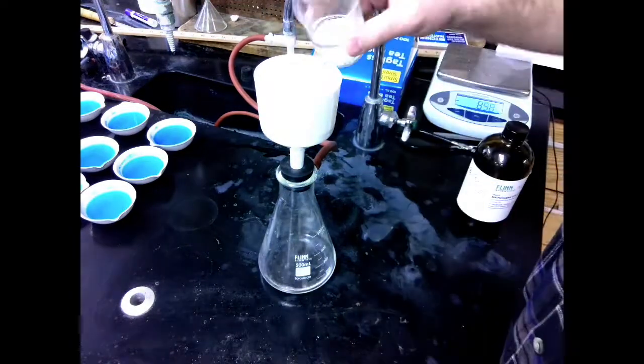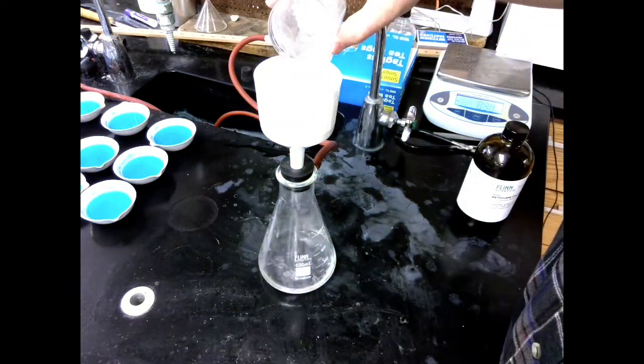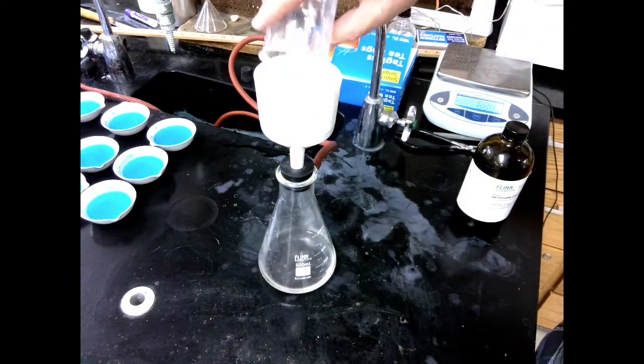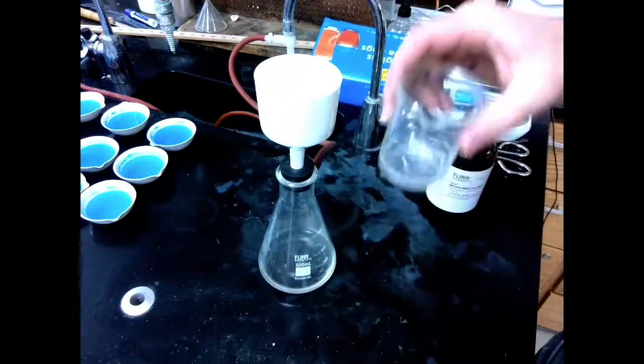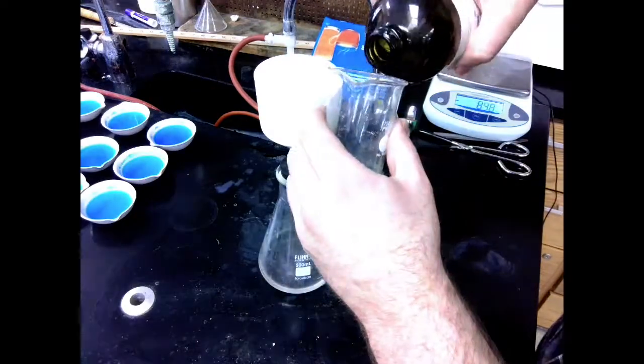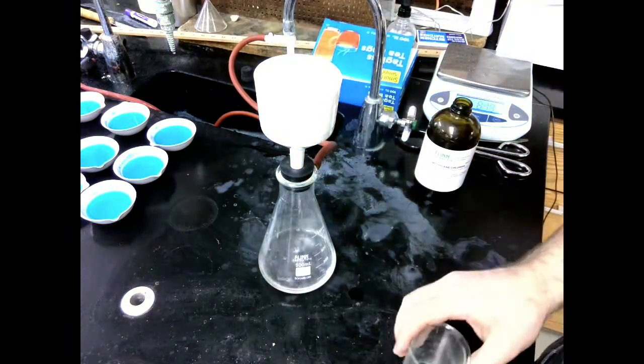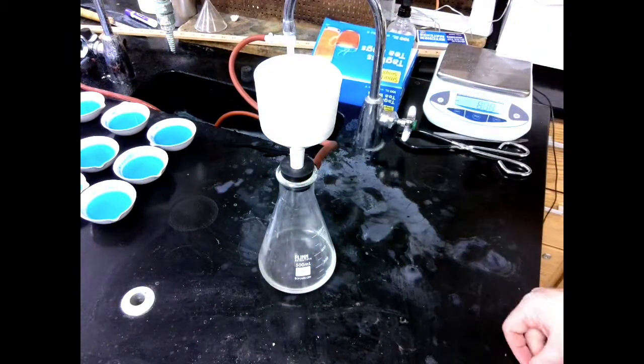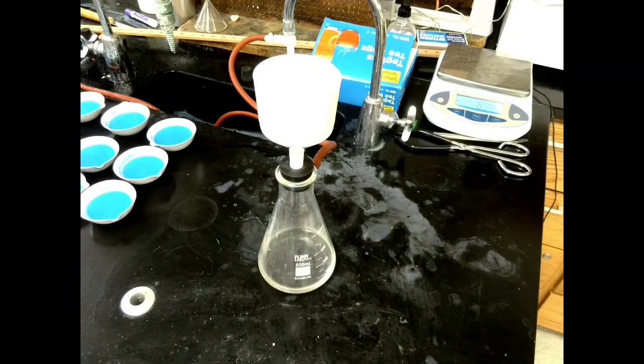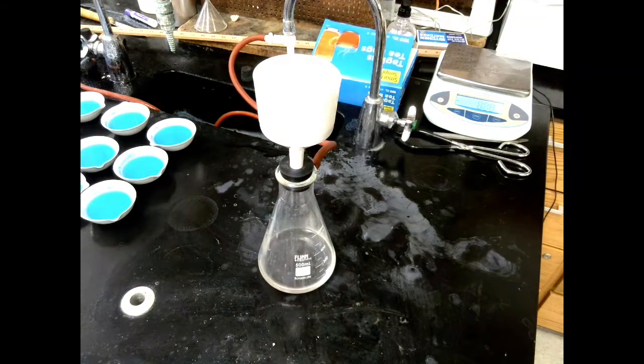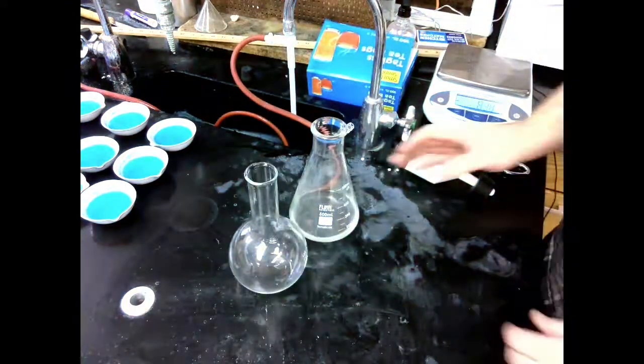And now we need to just get our dichloromethane separated from the calcium chloride. So we set up a Buchner funnel, and we are going to pour the dichloromethane through it. Notice I'm washing the beaker and the calcium chloride a little bit with just a little bit of dichloromethane, just to try and get as much out of it as possible. I don't want any clinging to the sides. And then we're going to take this leftover, and we are going to put it into a Florence flask. 250 milliliter Florence flask.